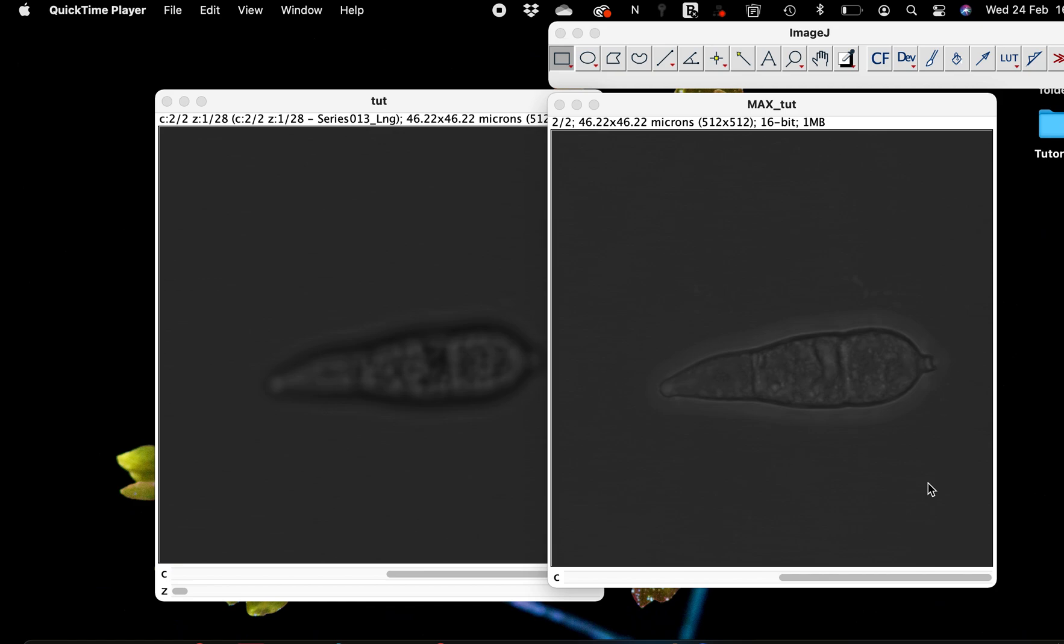With today's tutorial, I will show you how to draw a scale bar, process this image into maximum projection, and each of the tasks I'm going to do on this image that is open before you, I'm going to use macro to record everything that I'll be doing.